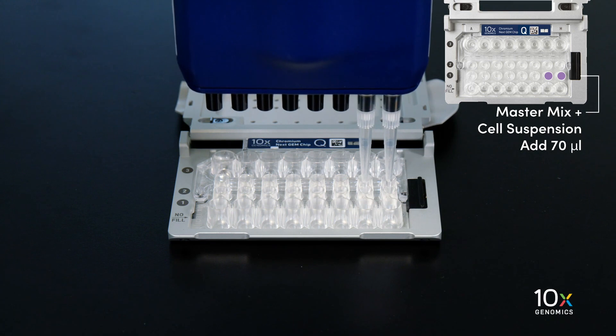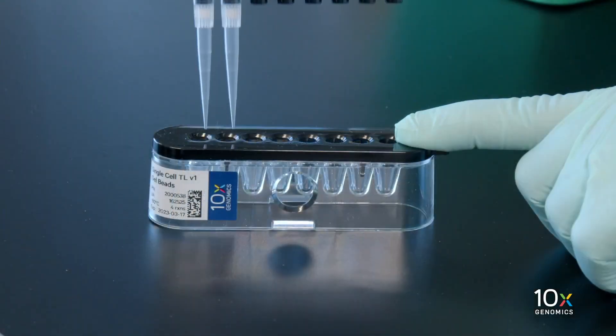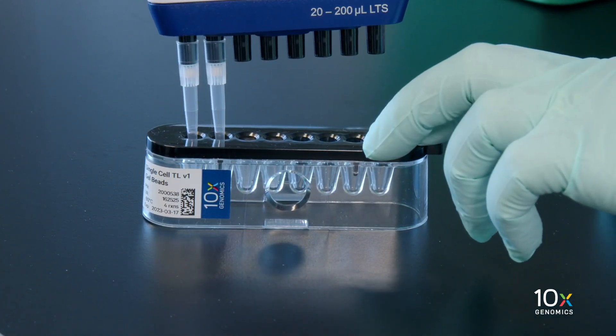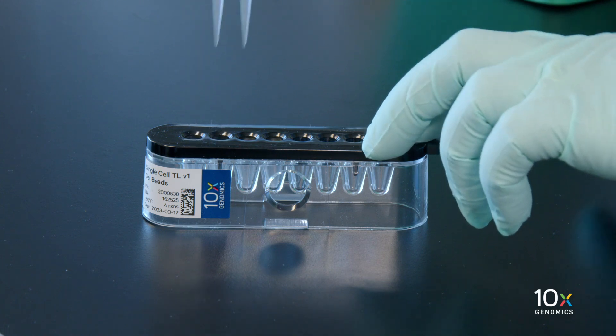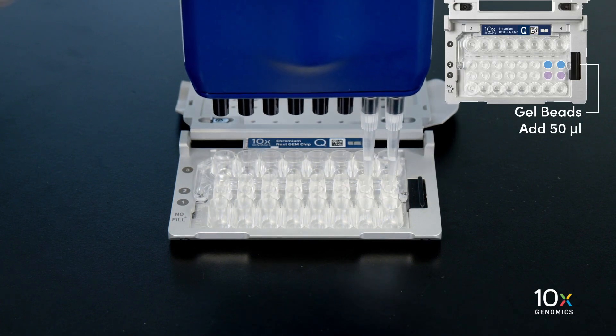Next we will load the gel beads. Puncture the foil seal of the gel bead tubes. Slowly aspirate 50 microliters of gel beads and dispense into the wells in the row labeled 2 without introducing bubbles.